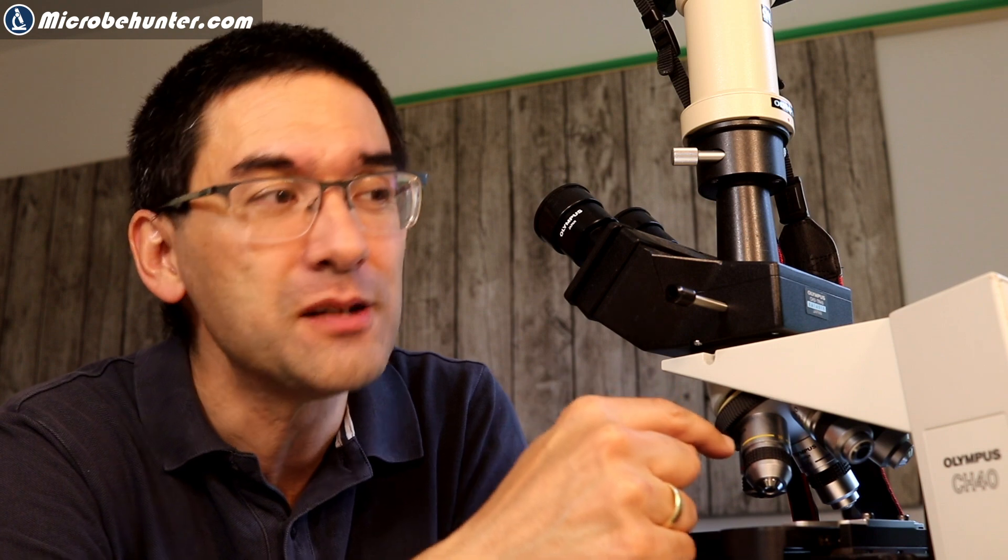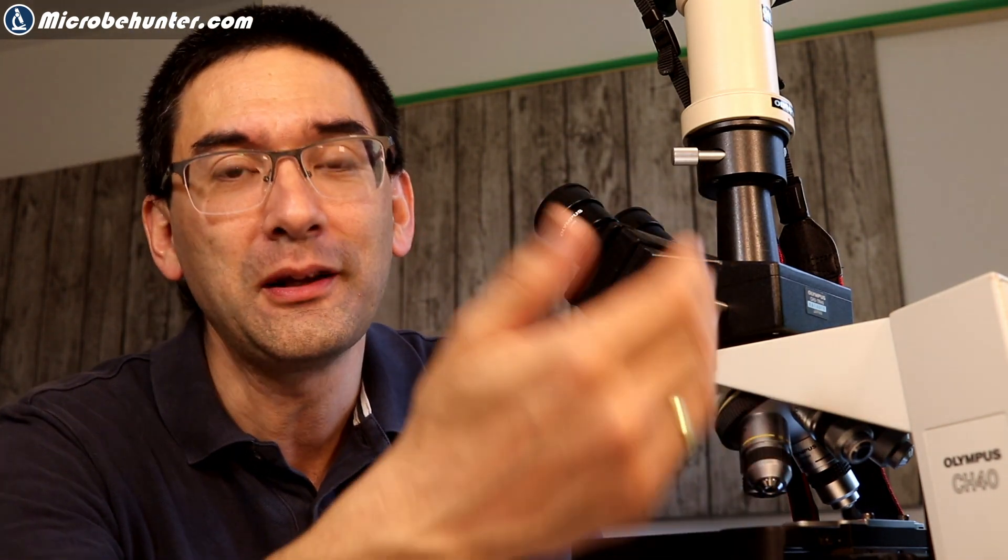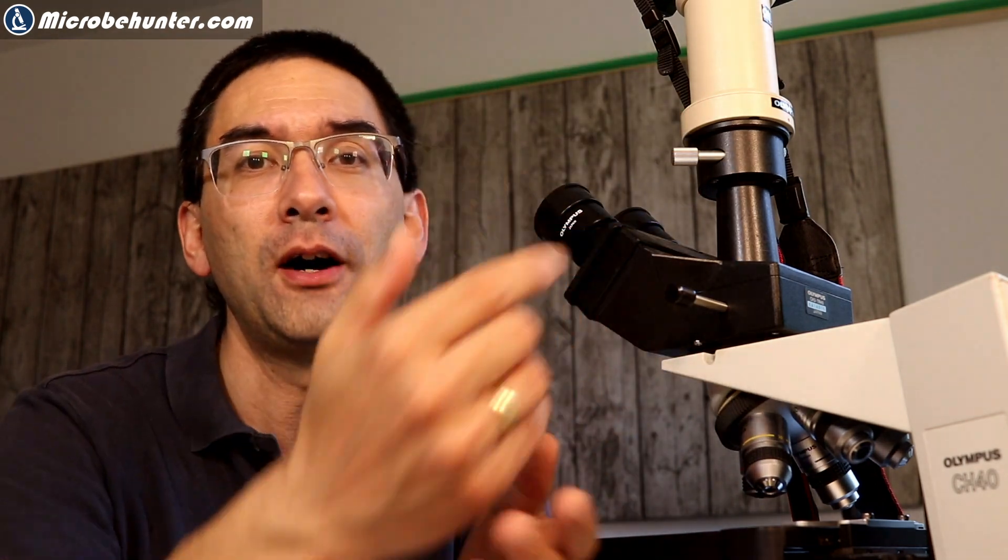However, if you have a choice now I would also say that there are also other factors that are important. Generally I would say if you're doing photography then of course it's a good idea to redirect as much light to the camera as possible because when I'm ready to take a picture then I'm not really looking through the eyepieces anyway but I'm using the LCD display on the camera to take the pictures. So in that sense it's of course a good idea to direct as much light to the camera as possible, but then again sometimes what I do is I turn down the light intensity anyway. So what's the point of redirecting all of the light to the camera if I'm lowering light intensity. You see what I'm trying to say here is that there are also other factors that are relevant and I just wanted to make it clear that 50-50 or 20-80 essentially just refers to the ratio of how the light is split.